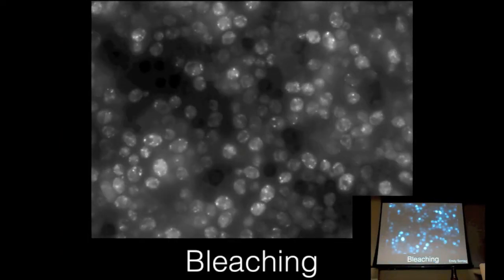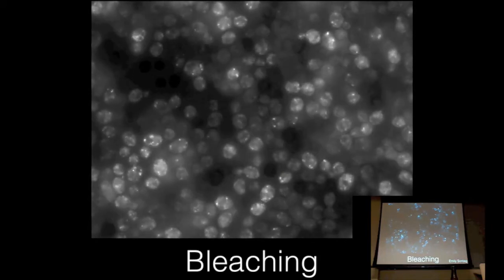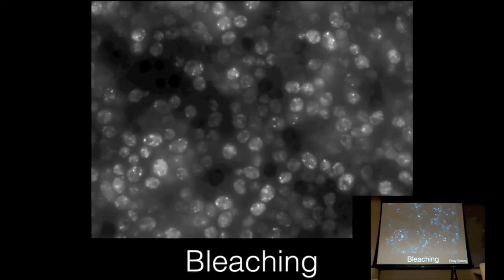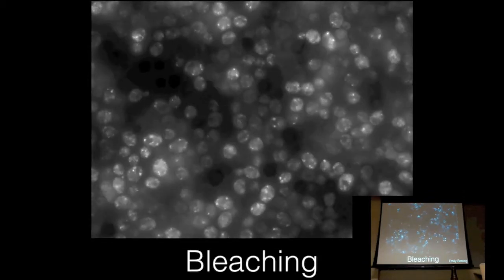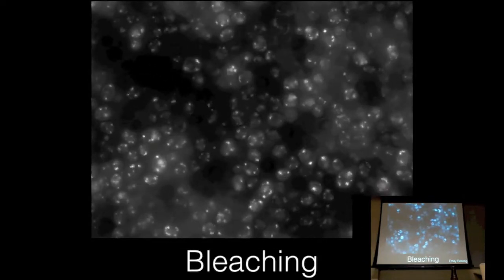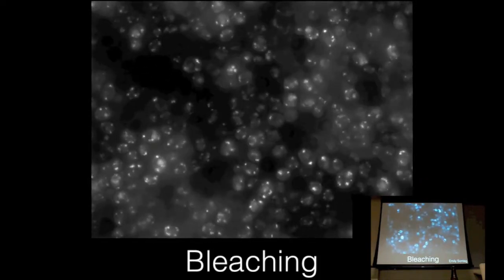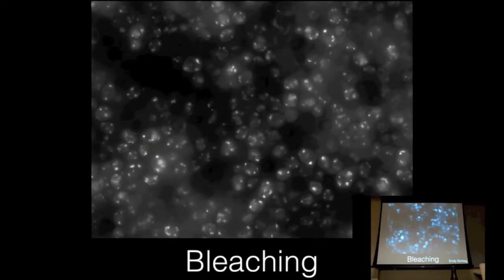So the first one is the one that we've talked about before, which is bleaching. I got this movie from Emily. Is Emily here? I've never met Emily. Okay, this is Emily. Emily sent me this movie because she's trying to analyze what are cells of some kind. You want to say a little bit about what this is? This movie is actually hers.